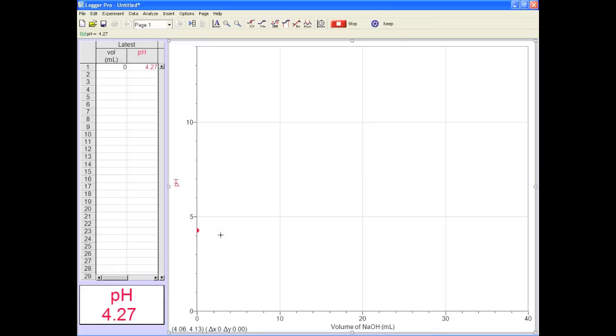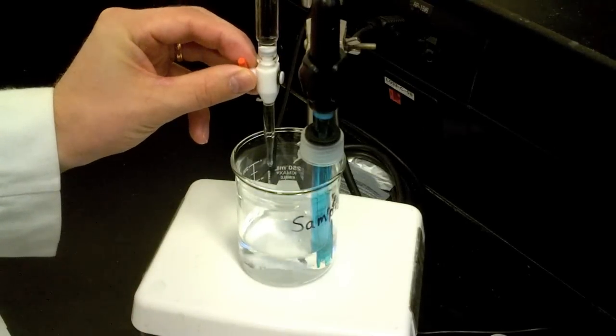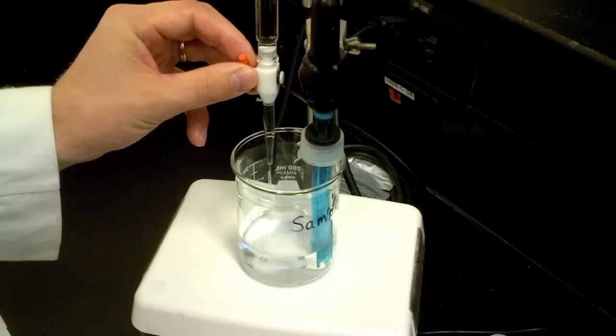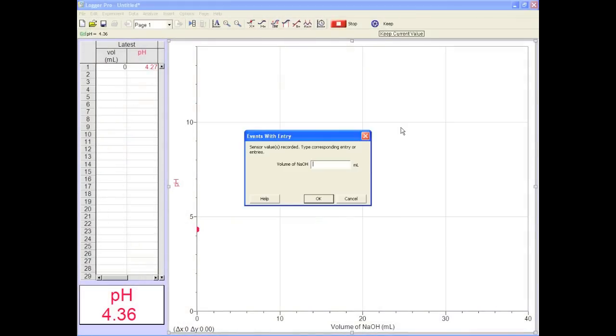Right. Now add some titrant, maybe a mil or so, but make sure you know the exact amount to two decimal places. Check out the pH as you add titrant, you don't want it to freak out on you when you don't expect it. Press keep again and enter the amount of titrant you added.